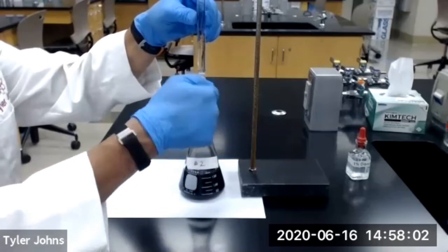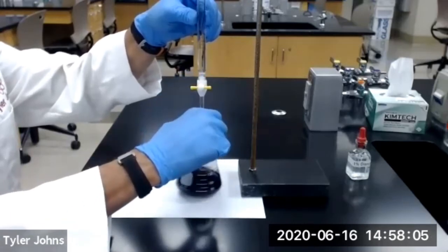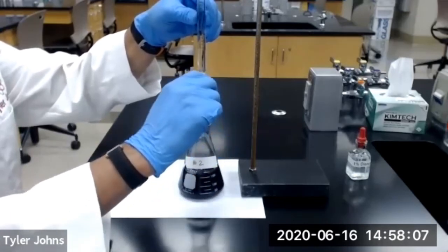Our blue color is starting to get lighter, so we are nearing the endpoint of our titration.